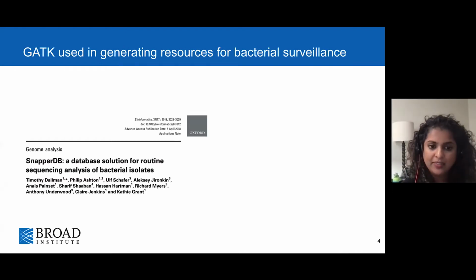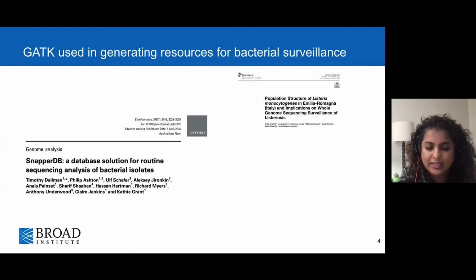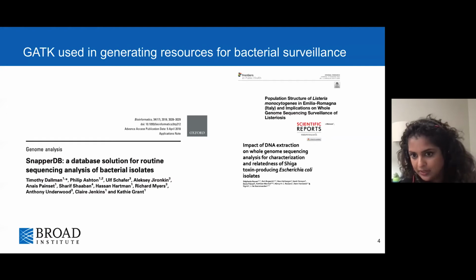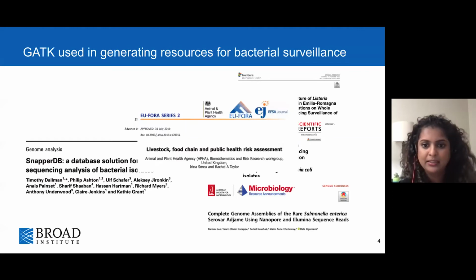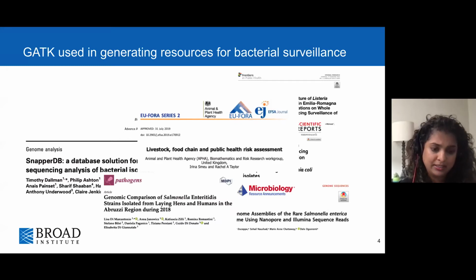And not only that, there are all of these other analyses that are using SnapperDB for their purposes. For example, the surveillance of listeriosis, this other analysis, which is about characterization of E. coli, characterization of rare salmonella, public health risk assessment reports, and outbreak studies.